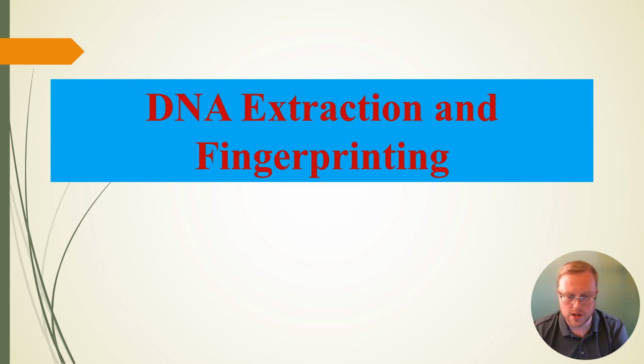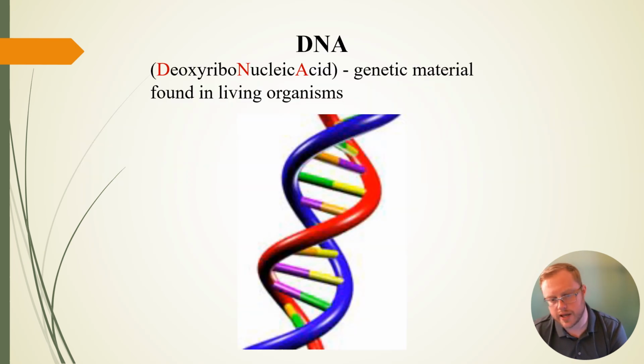So today's topic is going to be on DNA extraction and DNA fingerprinting. DNA, or deoxyribonucleic acid, is the genetic material found in living organisms. So this is where we store our blueprint for how to build a human body.